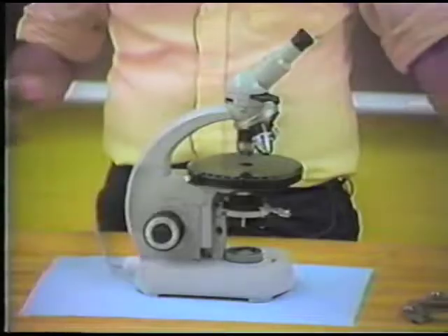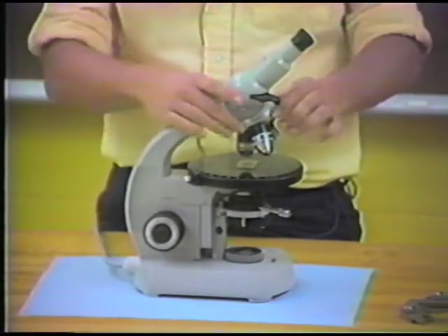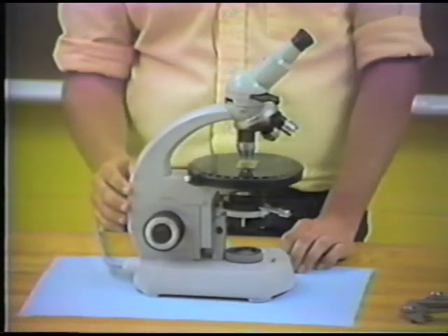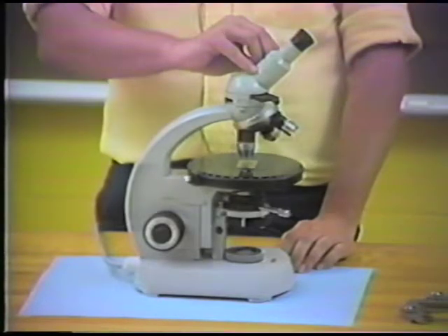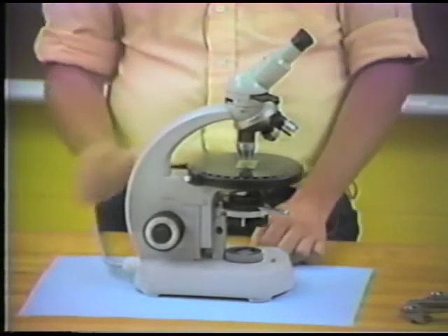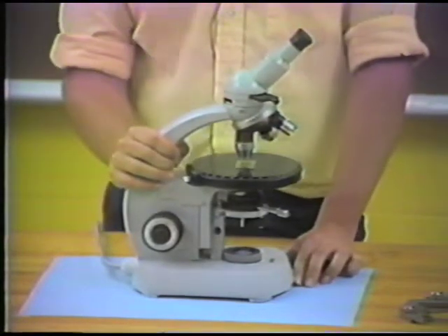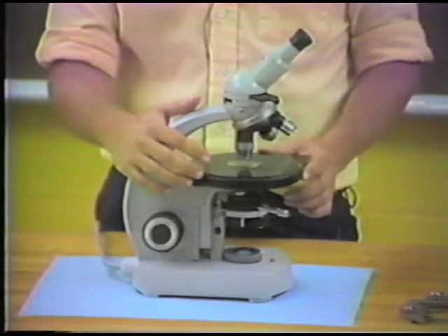Here again, I'm just taking a very large specimen of biotite, putting it on the microscope stage, and I'll rotate to my high power objective, and I'll put in the Bertrand lens and the converging lens into the field of view, and usually turn my light source up nice and high, and take a look at this interference figure that we're seeing in conoscopic view from the mineral biotite.